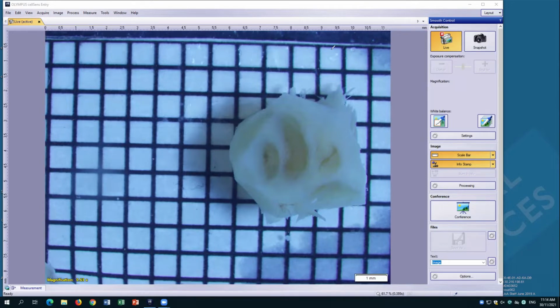And the whole process takes 8 weeks for sheep cochlea, and somewhere between 3 to 4 months for human cochlea, with constant changing of solution and trimming of the bone. So it's a long time effort because of the size and the thickness of the bone, but in the end, it's soft enough that we can section. If we want to take a tissue section, we can trim away bits of bone as needed.